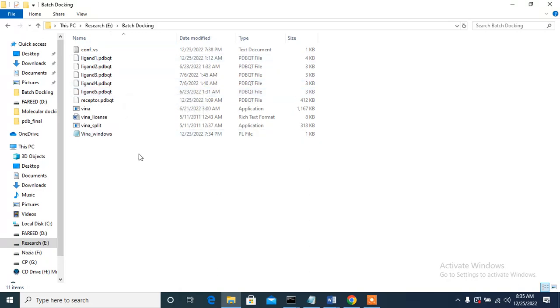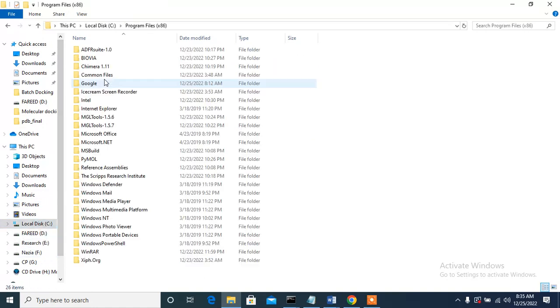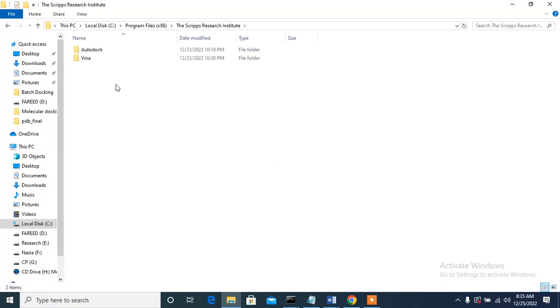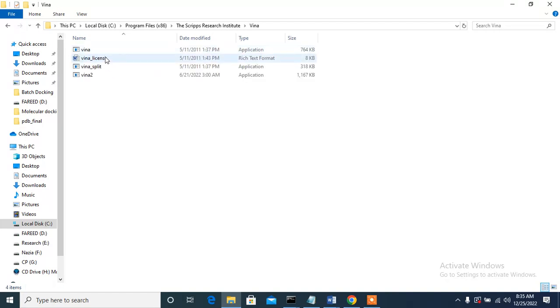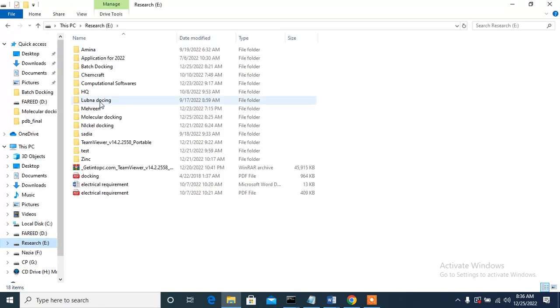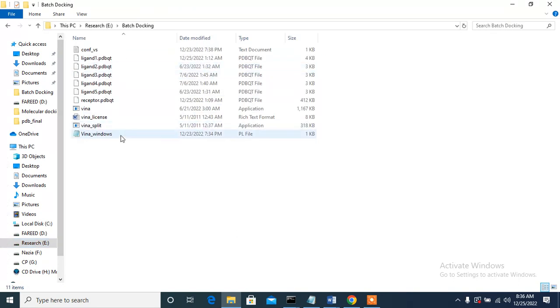Make sure these files are in the folder from where you are running the batch docking. To get vina, vina license, and vina split, go to the C directory where you have installed Vina — the Scripps Research Institute installation folder. There you will find vina, vina license, and vena split. You can copy these three files and paste them into your working folder. I have already done that to save time.